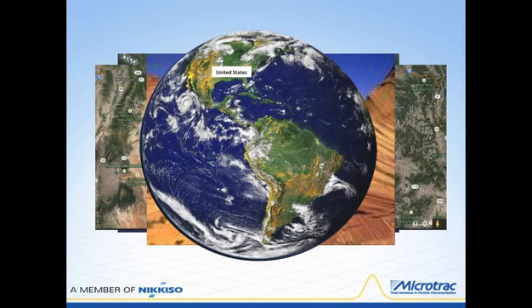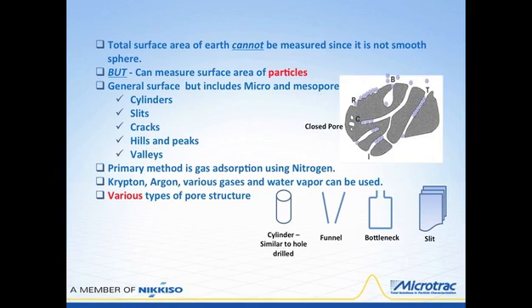But when it comes to particles, we can make that measurement, and that's because they are much smaller, and we can perform certain tests that are not possible on Earth. The general surface of a particle by many particle-size measurements would provide us with some type of an outline or equivalent spherical diameter. But when we start to look at surface area, there are many features that really add to that surface area, and these can be particles that have objects or pieces that are removed or never solidified inside the particle. And these can cause voids in terms of cylinders, slits, cracks, hills, peaks.